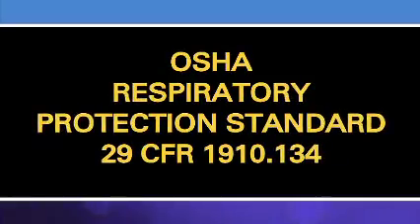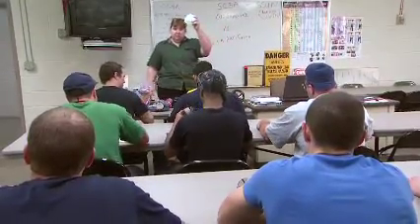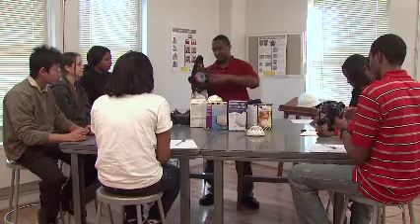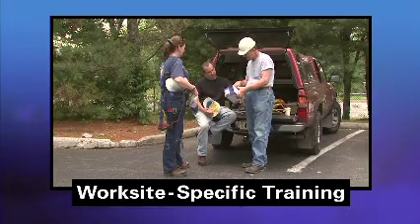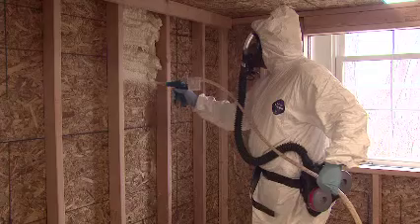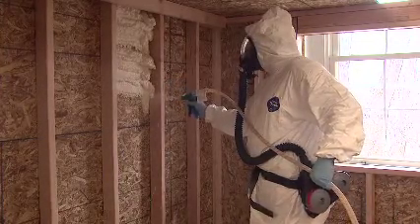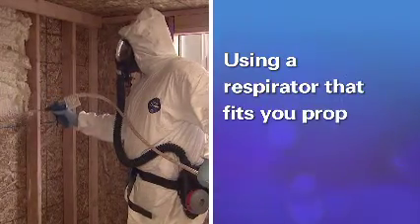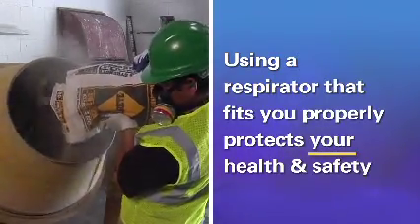This video provides a brief overview and general information about fit testing requirements under the federal OSHA or state OSHA respiratory protection standards. This video can be a part of the OSHA-required respiratory protection training, which includes many topics, like how to put on and take off a respirator and how to use, clean, and maintain your respirator. Your employer must also provide you with worksite-specific training. While this video discusses some of your employer's responsibilities under OSHA's respiratory protection fit testing requirements, it is important to remember that using a respirator that fits you properly protects your health and safety.